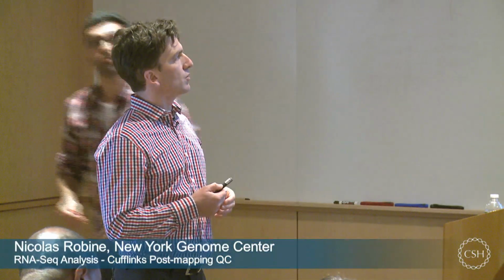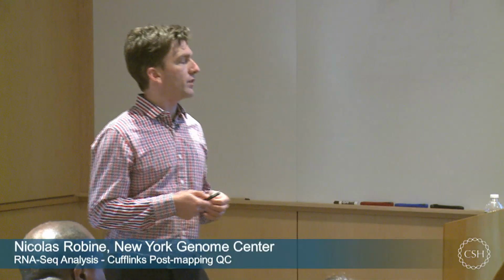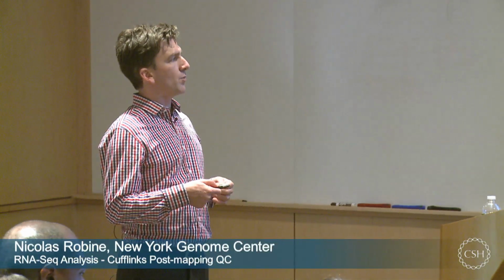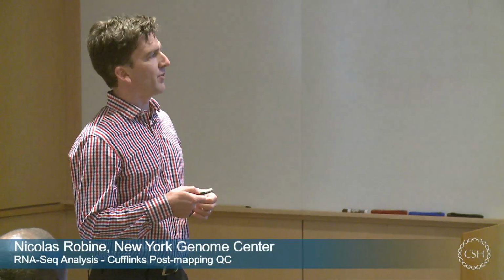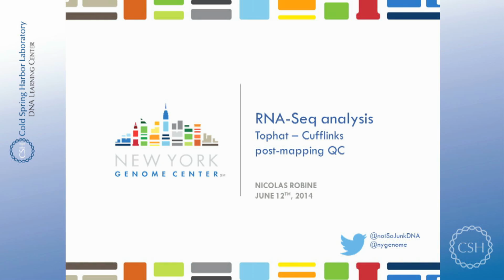I plan for this afternoon to talk about two different steps. One is the alignment, and one is the quantification. And I think more importantly, and I don't know if that will reflect in the number of slides, but maybe that's where we also need to spend some time, is to discuss the quality control after the alignment.